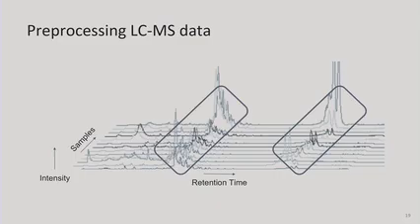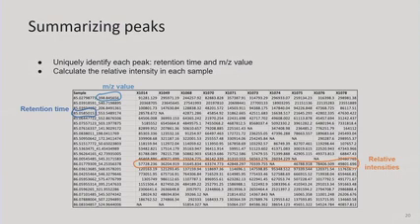What is data processing, or pre-processing, of LC-MS data? In one graph, as you can see here, we just try to find the peaks from the raw data in the different dimensions, to make the peaks high quality and reasonable by using an auto-optimized workflow. So the ideal result for us is some summarized peaks. This is a result from MetaboAnalyst. We are going to show you later.